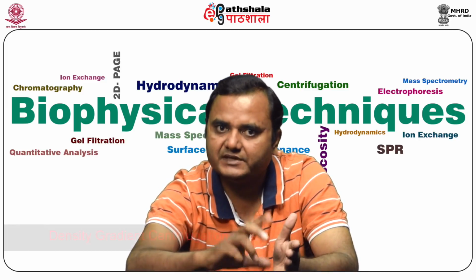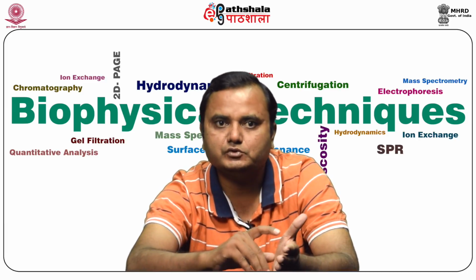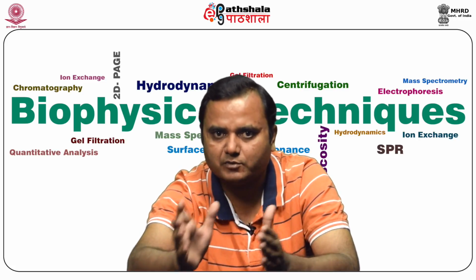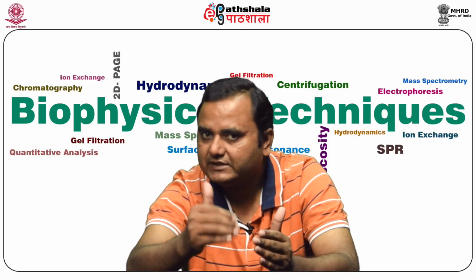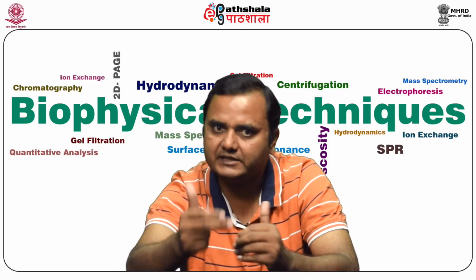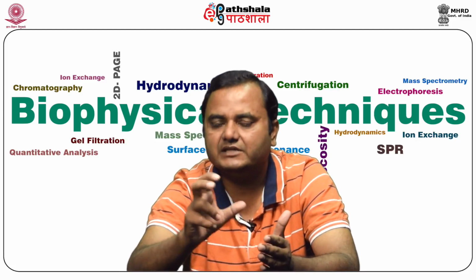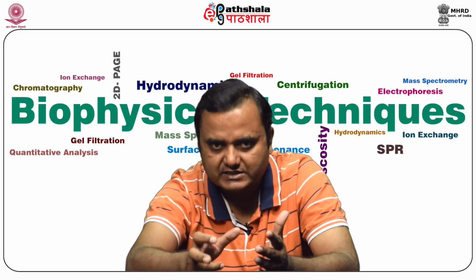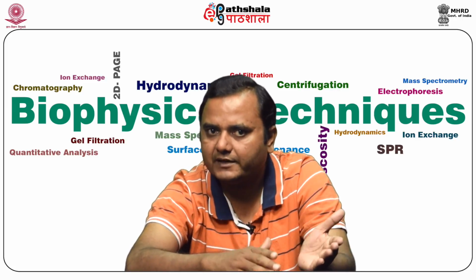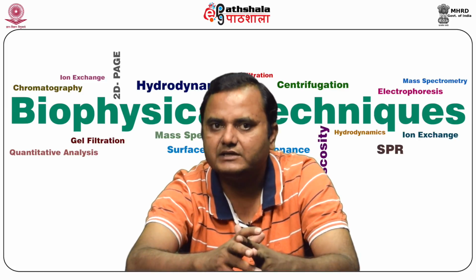But in density gradient centrifugation, the cell extract is centrifuged through a medium whose density gradually increases towards the bottom of the centrifuge tube. So in differential centrifugation there is no density gradient, but in density gradient centrifugation there is a medium with its own viscosity and density. The difference between the density of the particle and the density of the medium is the main important factor for the separation of molecules.